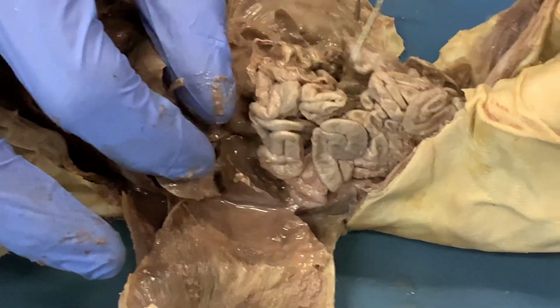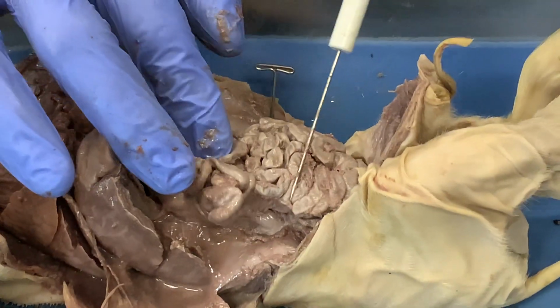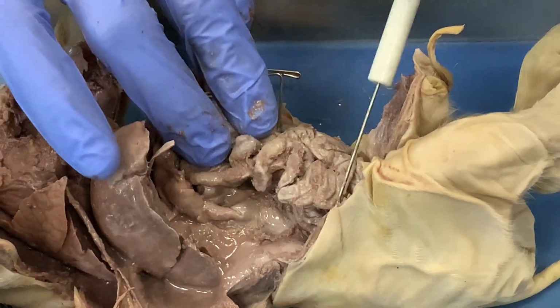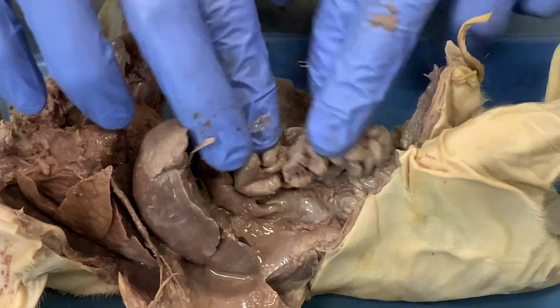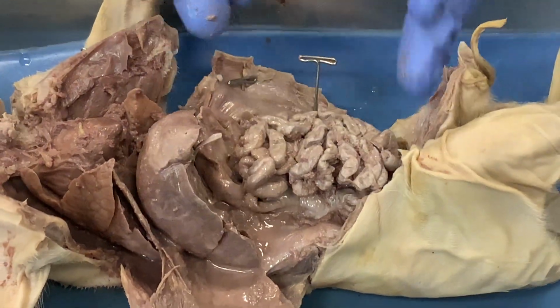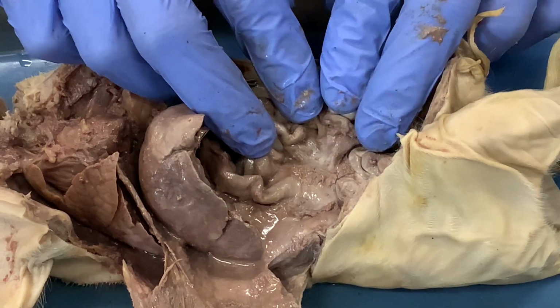Now, the small intestines are much longer than in the frog, and that's because of a different type of digestion and different amount of digestive enzymes. The absorption area has to be much bigger on a pig.